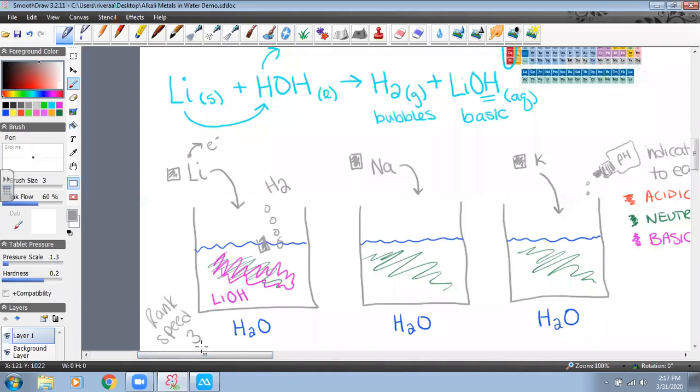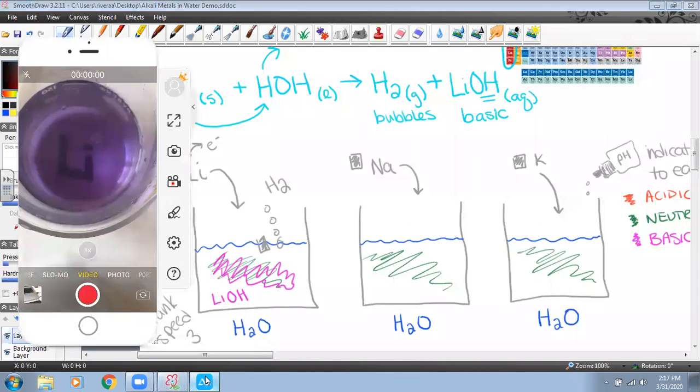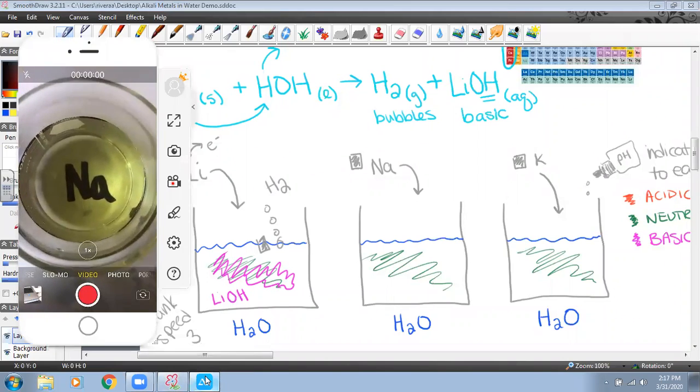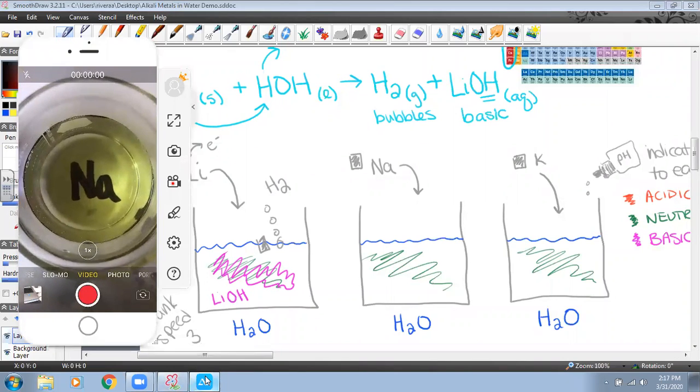Okay. Now we're going to do sodium. Moving over. You guys still with me? Eleanor? Yes. Excellent. Okay.